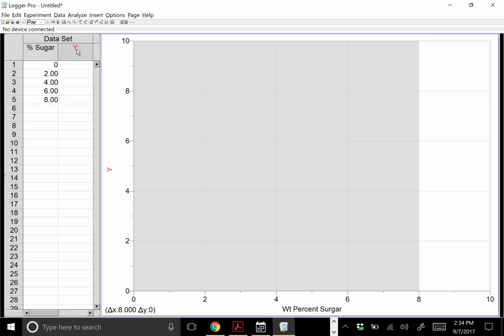In this lab, after we made up our solutions, we went and got the density of everything. So I'm going to tap in some densities here. The density of water should be about 1.00. Density of solution A, I'm going to go with 1.100. Solution B, 1.132. Solution C, 1.302. And the last solution, I'm going to go with 1.495. Now, yours are going to be different than this. But again, you can see I don't have the 4 significant figures I want in each of these.